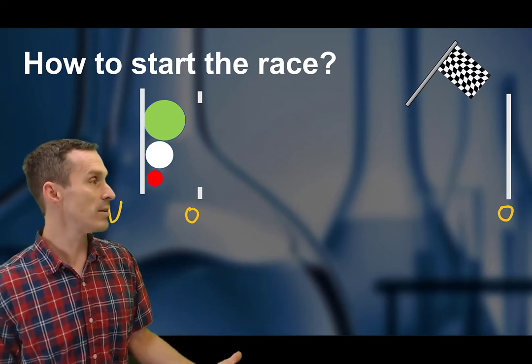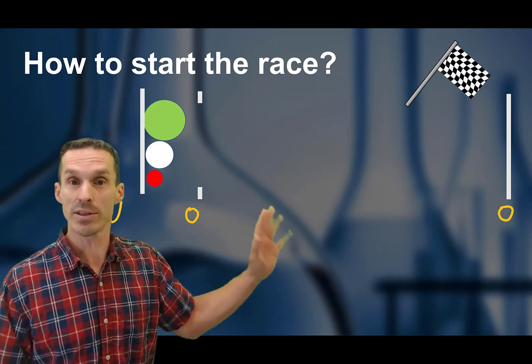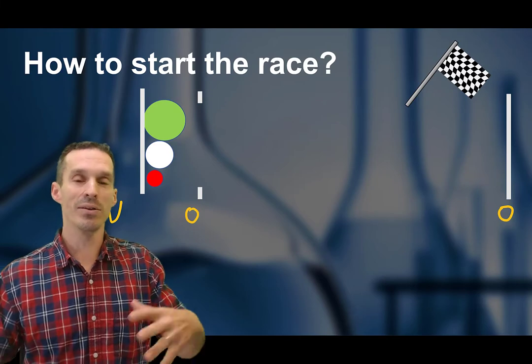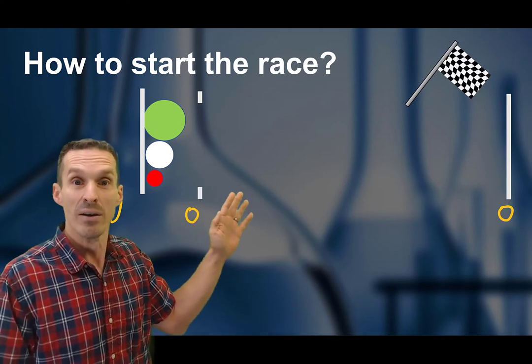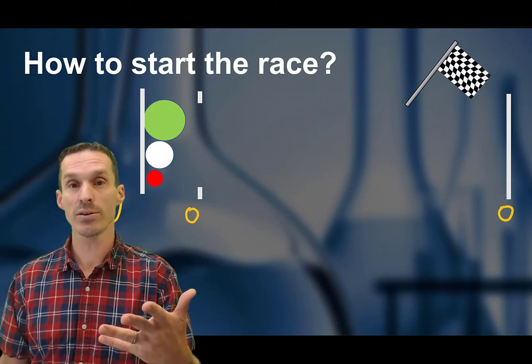But now I'm asking a different question. How do we start the race? All the ions do need to move from the beginning at the same starting point. And the problem we have is that if they're spread out inside of that source region, well, the accelerating voltage will be entirely different. So one way to do that is to basically paint or paste the ions down onto the surface plate itself. So in this case here, the ions are solids.